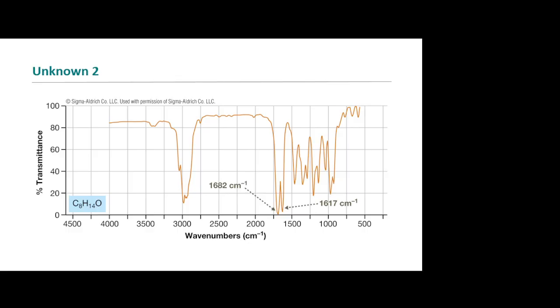Okay. What exactly are you looking at right now? For the CH stretch connected to an alkene? Yeah, that's the CH stretch. That's up here. So the C=C stretch for an alkene. Is it between 1620 to 1680? Okay. So 1620 to 1680, right? Do we have something that's near that range? We have 1682, don't we? Yeah. And so that's probably our alkene stretch, isn't it?